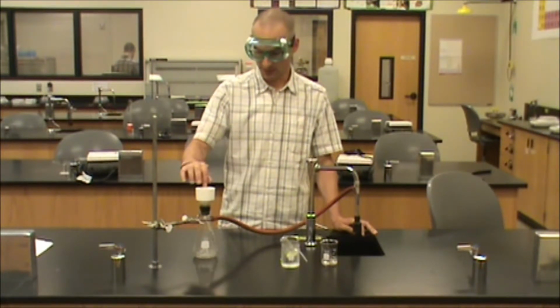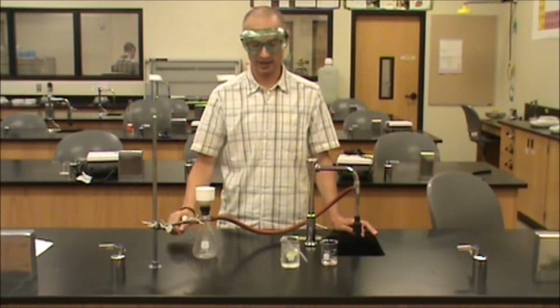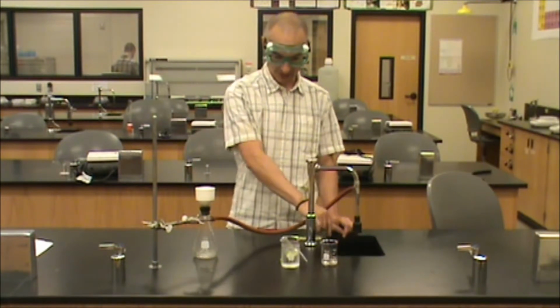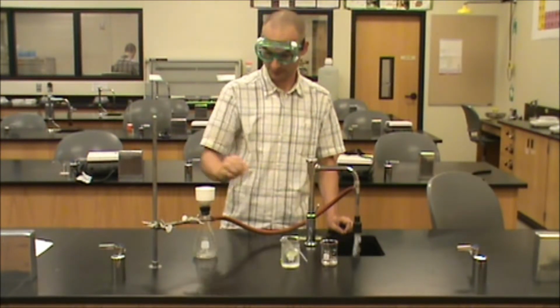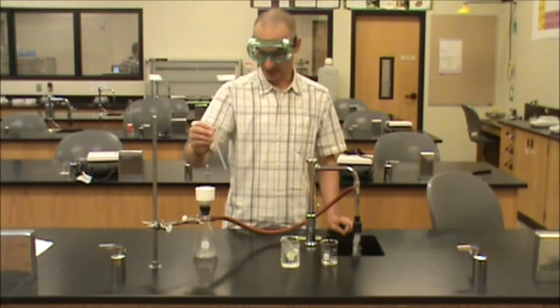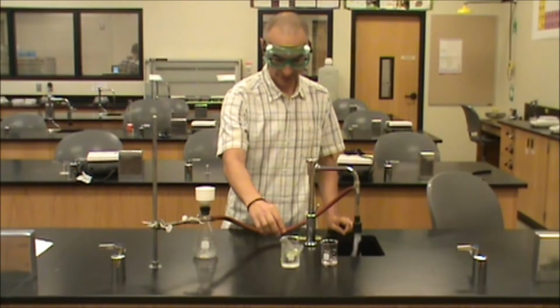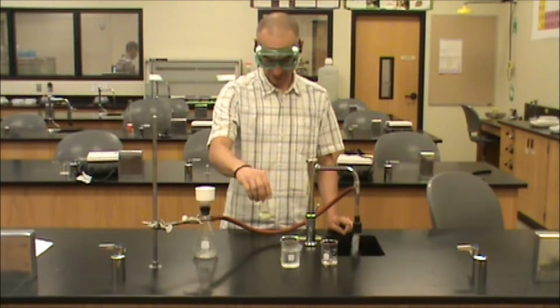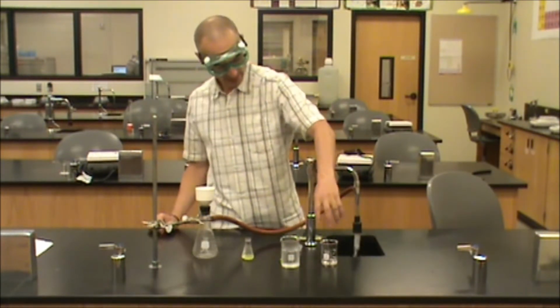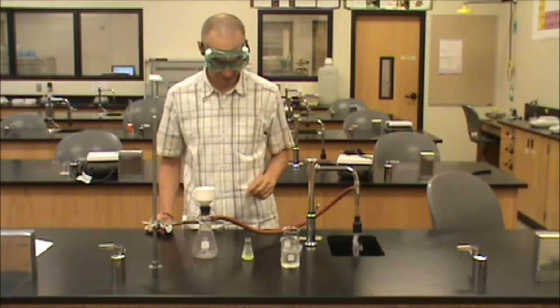It's very important that you add 1 sheet of filter paper to your Buchner funnel. If you fail to do this, your crystals will fall right through into the sidearm flask. I am now going to turn on the aspirator. And I'm going to add a few milliliters of ethanol to moisten our filter paper. I'm going to remove our Erlenmeyer flask from the ice bath, and I'm going to put our solvent in the ice bath to cool it to around 0 degrees.